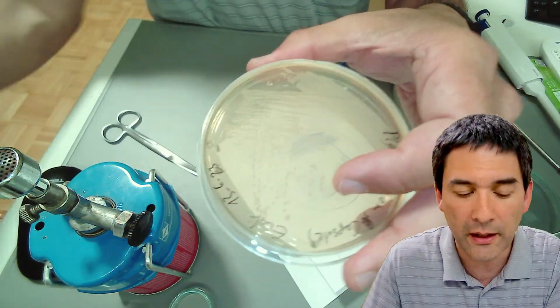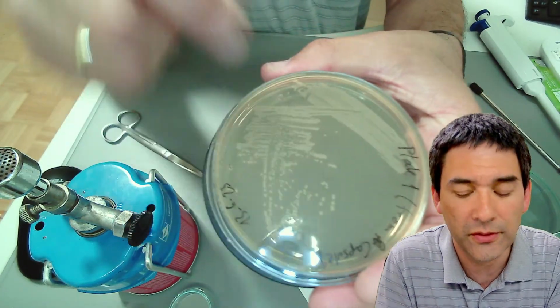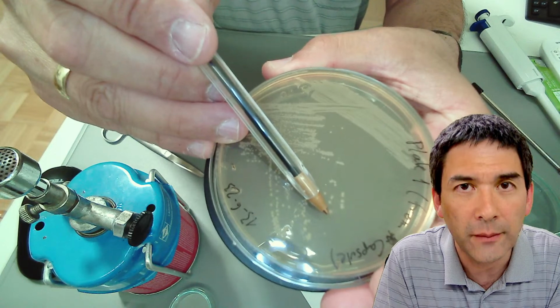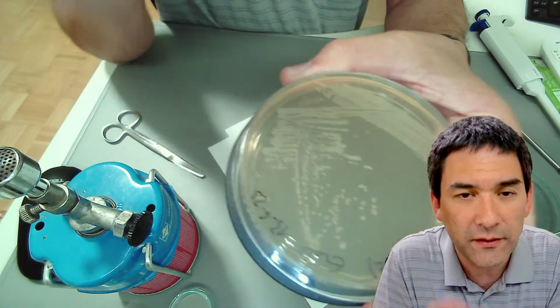And as a matter of fact, with this plate over here, maybe I'm going to use a dark background here. You're able to see how I have done that, and you're able to see over here those individual dots. These are the individual colonies. So one of those dots here comes from one bacterium.